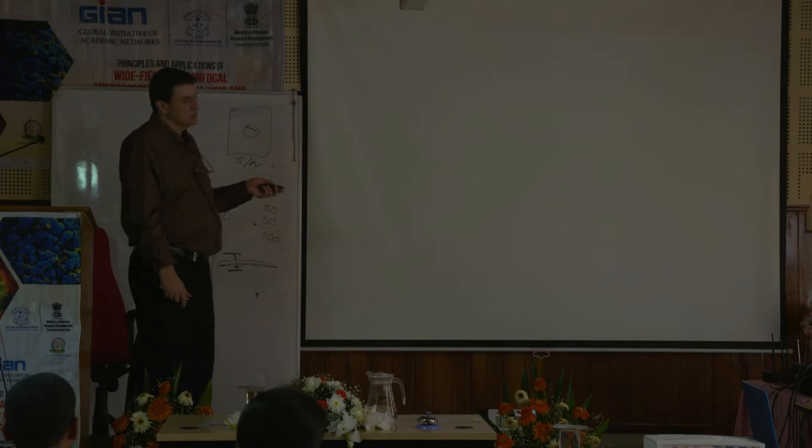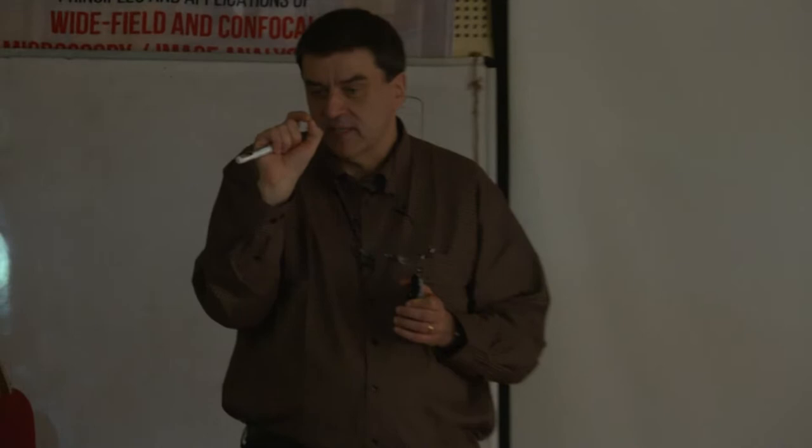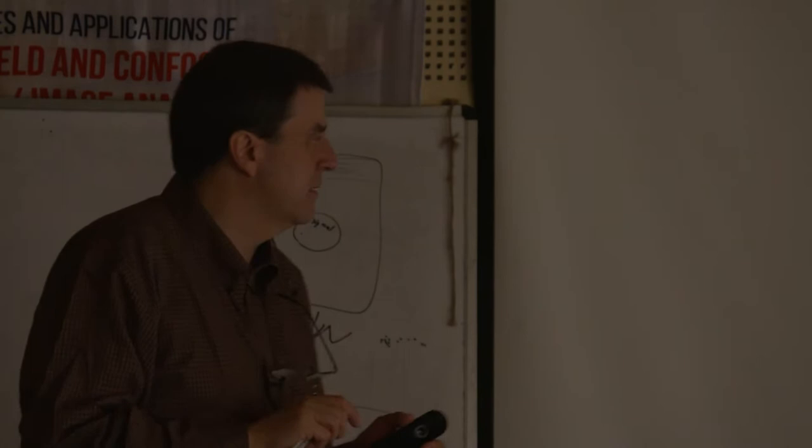Correct? Okay. So that whole slide, what it showed, basically, the idea of super resolution is you're not really looking at the entire object. You're looking at the little single molecule fluorescent molecules that actually are making up that object. So you're going to look at those individual dots, basically. And I think we saw some of that with his talk yesterday, how you saw it was sort of dotty, you know. Because you're looking at single molecules here, okay? So if we could keep looking at the single molecules, we'd be okay.